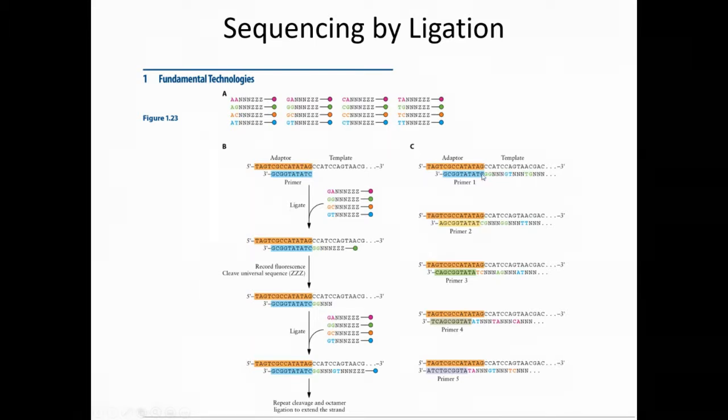For the second round, you move the primer 1 nucleotide away from the previous primer. So originally you have this TATC, and now you move 1 to the left, so it's only TAT, and then you add 1 extra nucleotide here. So that means primer 2 will give 1 space here, moved 1 nucleotide to the left.